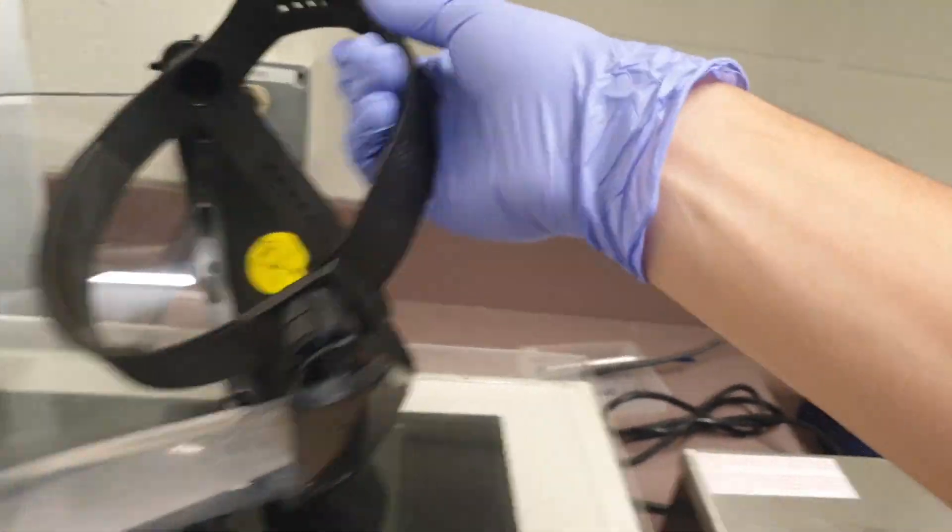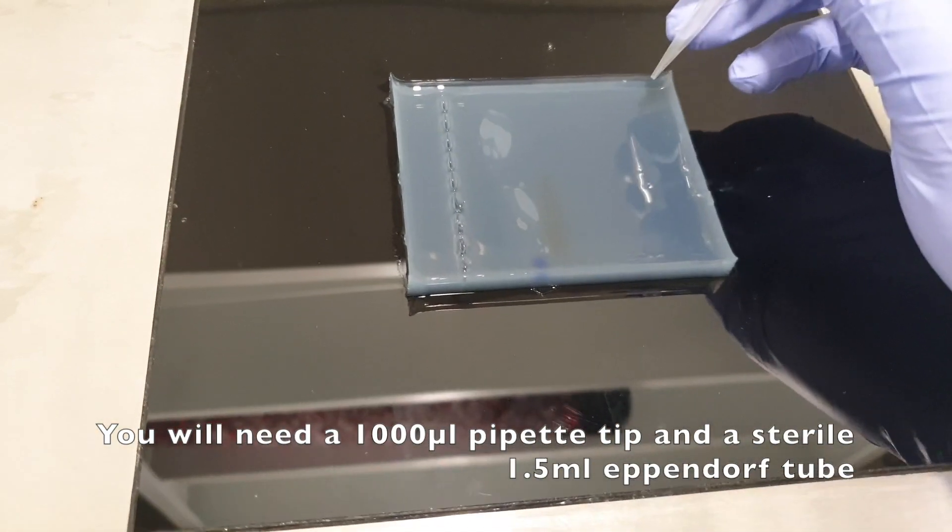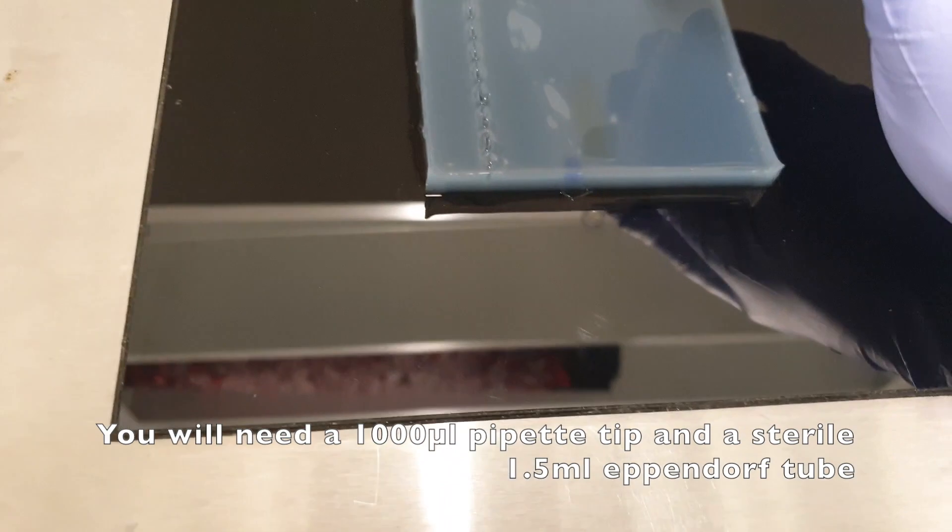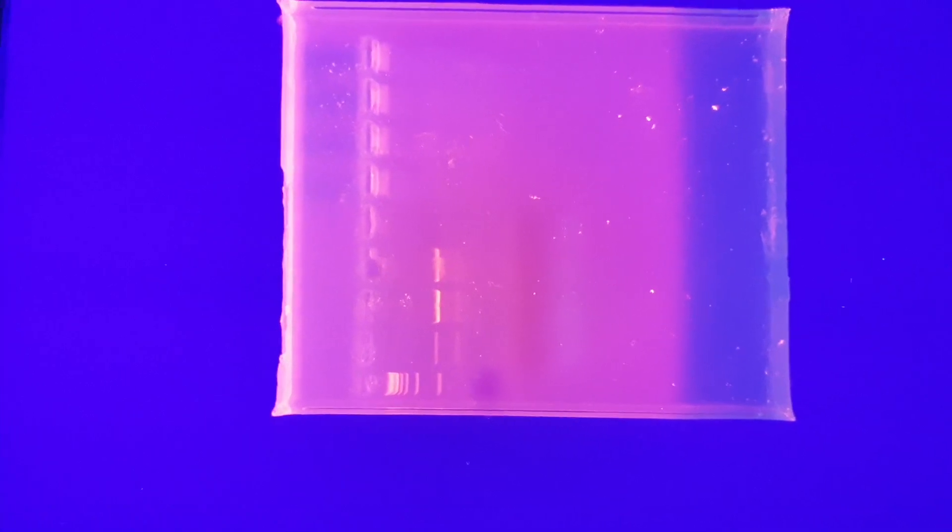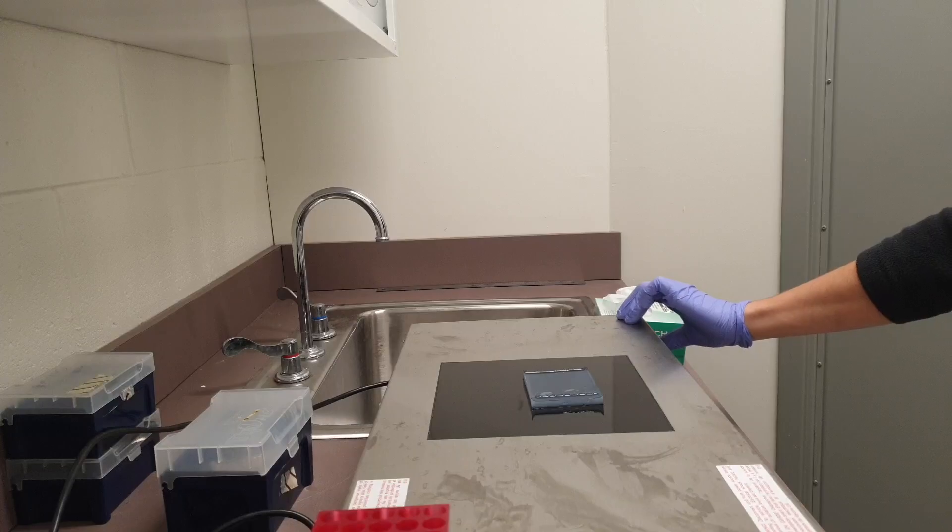What we're going to do is grab a sterile pipette tip, find the band that's going to be created, and then just poke it, hold it like this, and transfer it into a sterile tube. As you can see, the bands are right here, and we're going to try to catch this one right there. We'll be super quick.